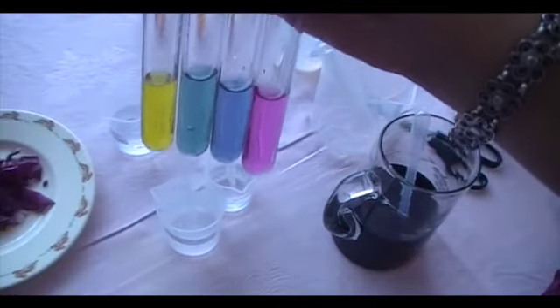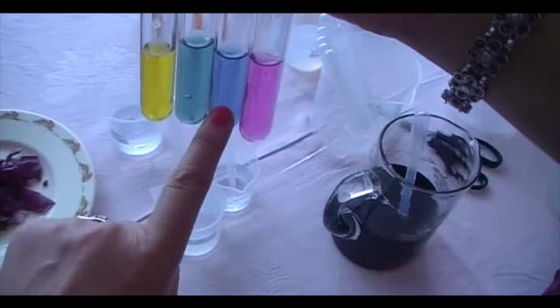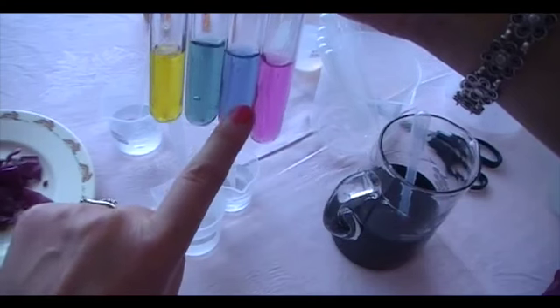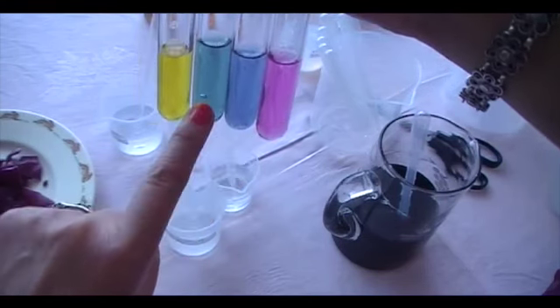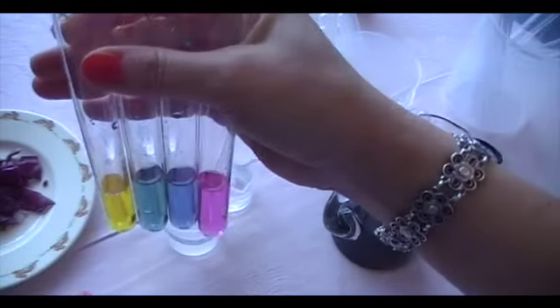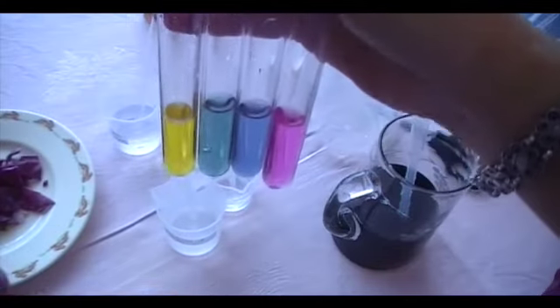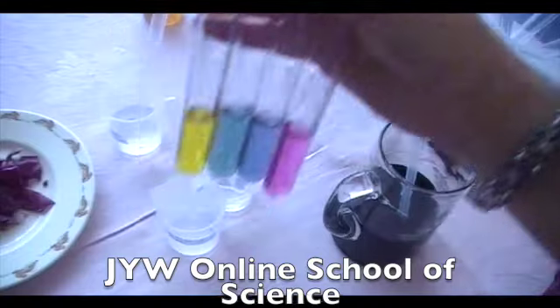You see that? Dark blue. So that is the water. That's the natural color of red cabbage. That is the water neutral color. That's the acidic color. That's alkaline, and that's again the alkaline color. So that gives you an indication whether this solution is acidic or alkaline.